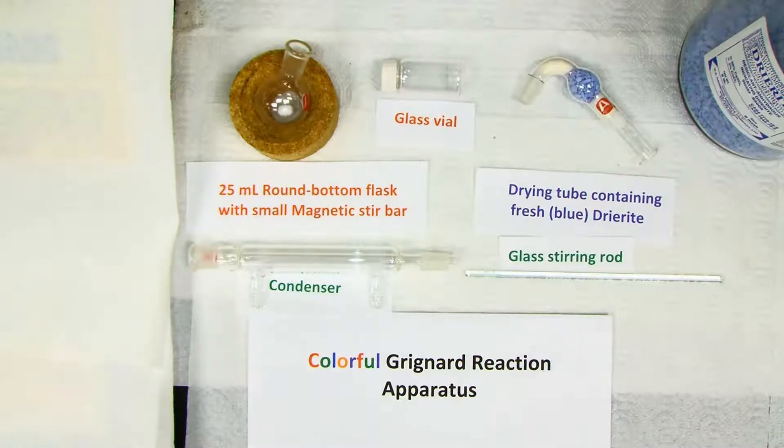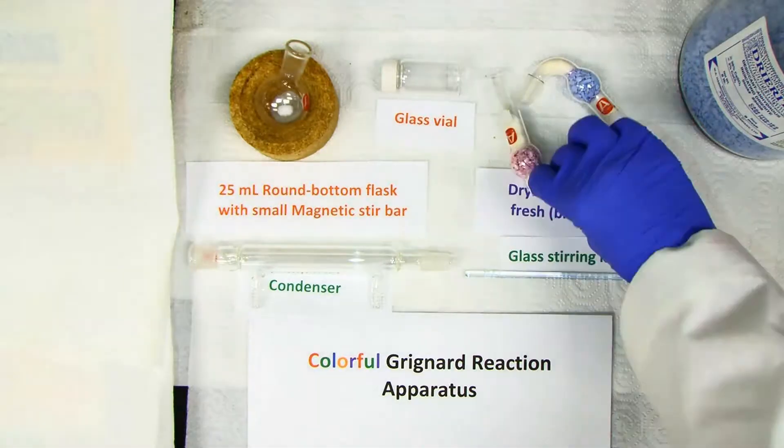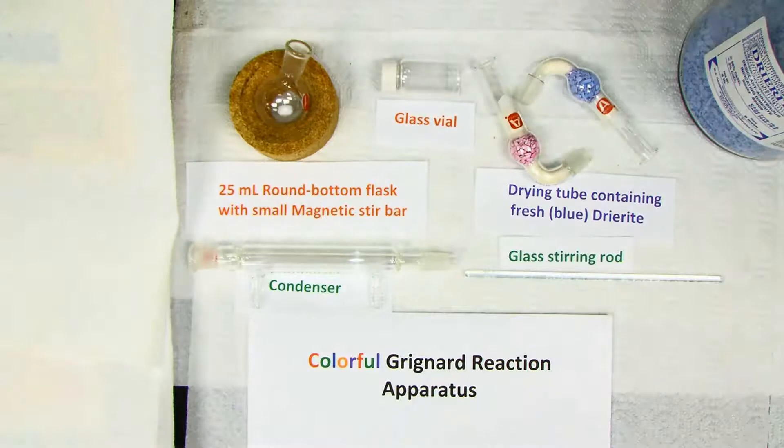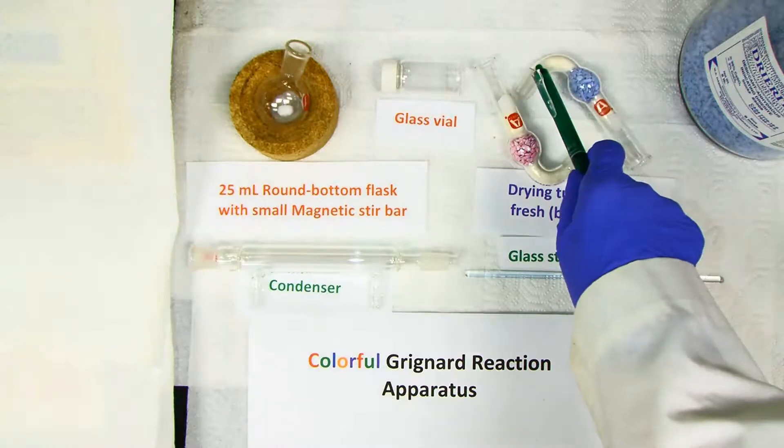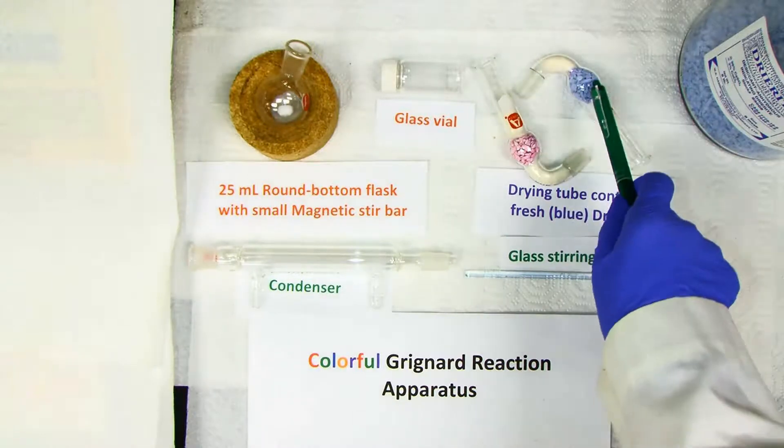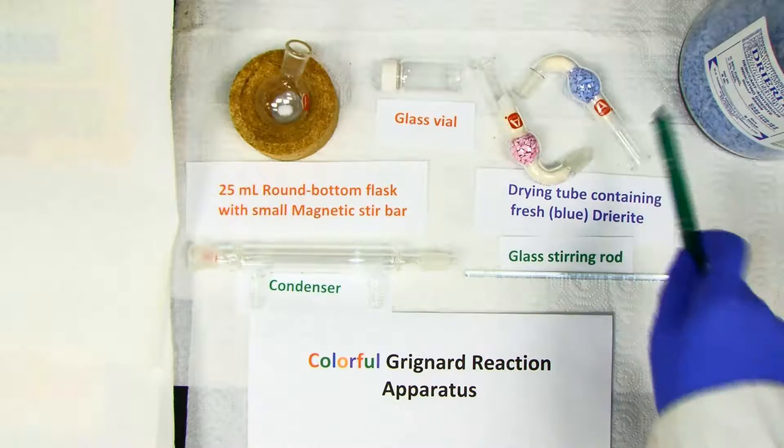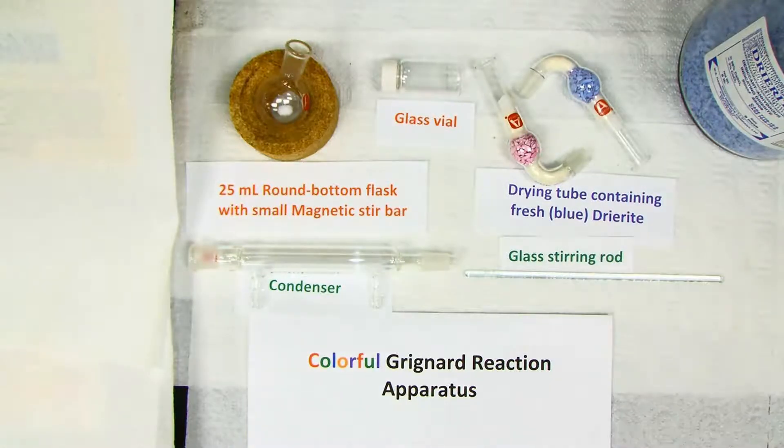So if the tube in your drawer looks like this, then you need to put the pink material into the bottle in the lab so designated and replace it with blue. The drying tube is filled by putting a piece of cotton in the neck, put the Drierite in, and then another piece of cotton. You don't have to pack it tightly.